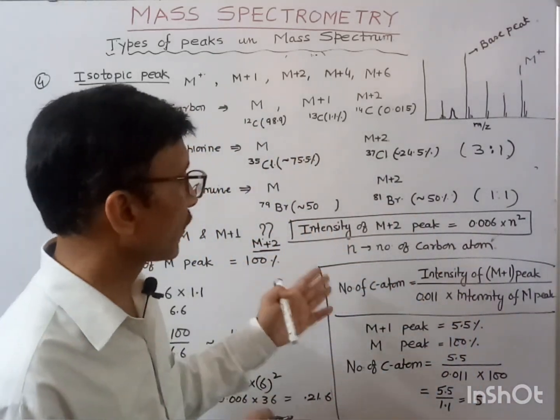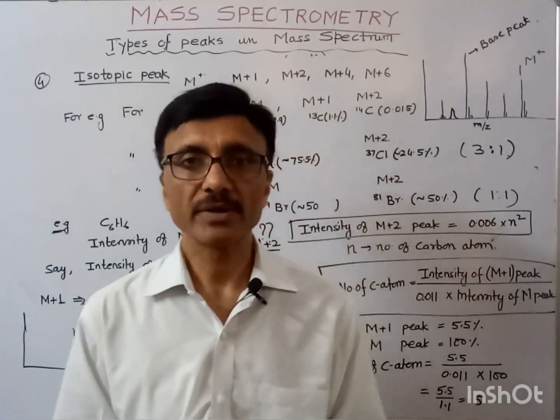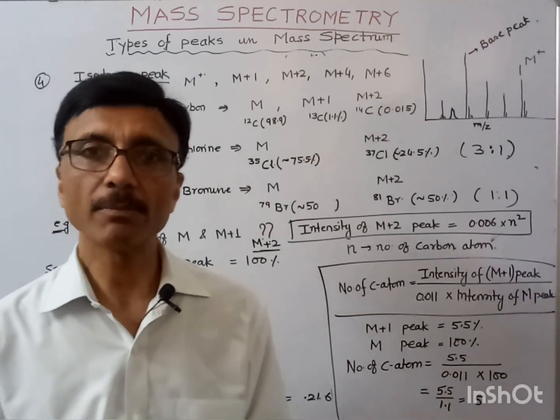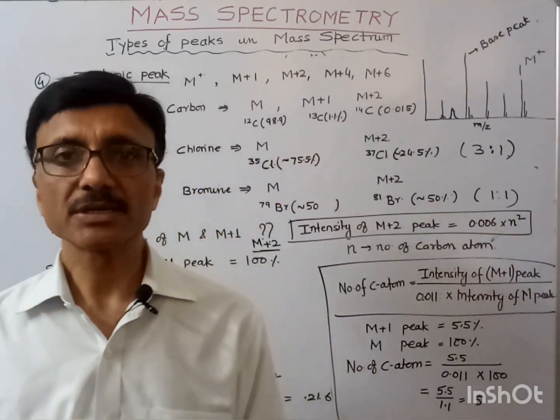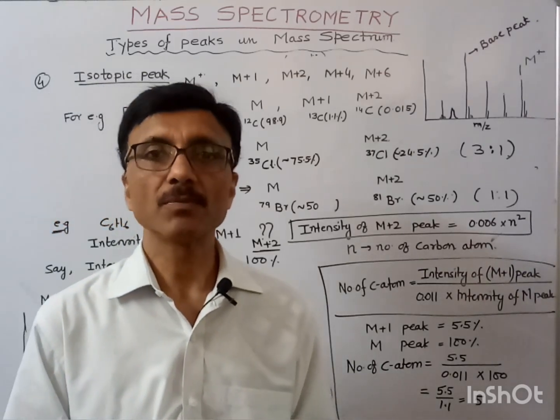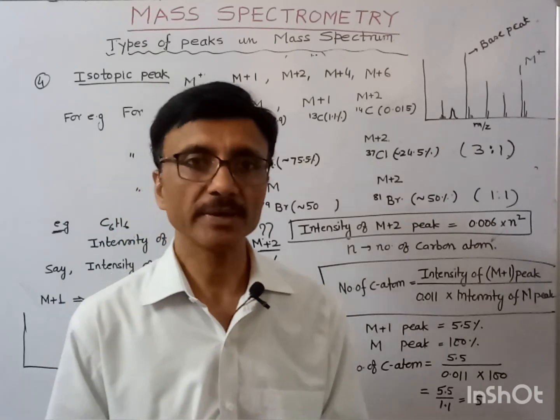So we can find it from this isotopic peak. We may get very important information about our unknown compound. Now, in my next lecture, I will discuss some more about the isotopic peaks or isotopic clusters.